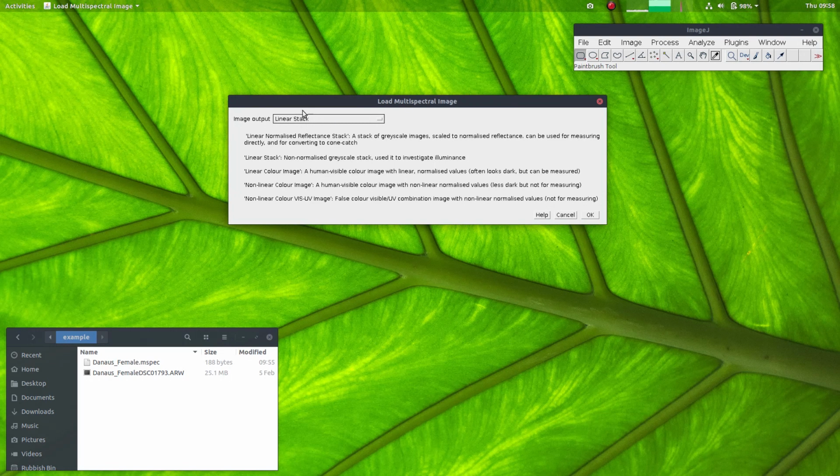This is very rarely going to be useful, but it will be of use if you're interested in measuring something about the illuminant itself, without performing the normalization. Normally we want to perform normalization to remove the color of the illuminant, but sometimes you might not want to do that for various reasons.